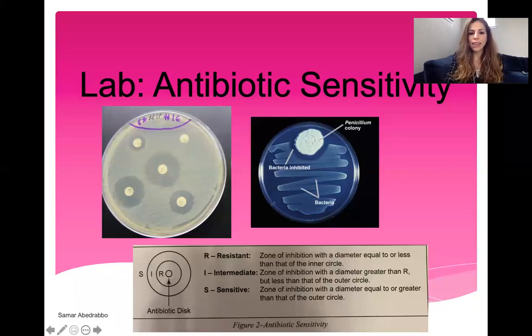I'm going to start with background, but just to show this picture, this is what you're going to be ultimately doing, where you take an agar plate and you put bacteria everywhere. We call that a lawn of bacteria. And then you take these different pieces of paper, which we call discs, and they're dipped in high concentrations of antibiotics. And then you spread them throughout the bacteria and you incubate the plate. And if the bacteria dies around the disc, or you don't see any more growth, inhibition of growth, it means that that antibiotic is effective. And we'll talk about it.